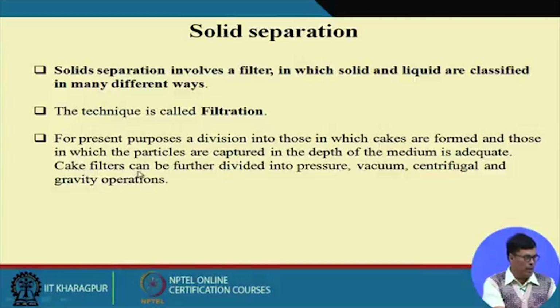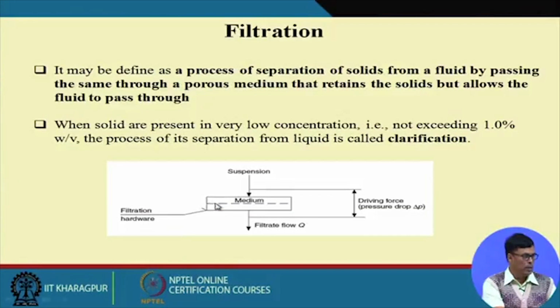The cake filters can further be divided into pressure, vacuum, centrifugal and gravitational operation. So in filtration, this is the media, this is the filtration hardware, and these are the suspended particles. The driving force is the pressure across the membrane, and we get the filtrate.